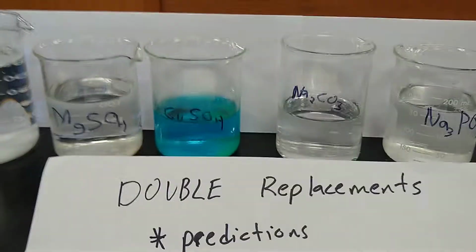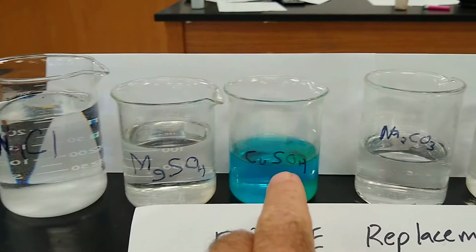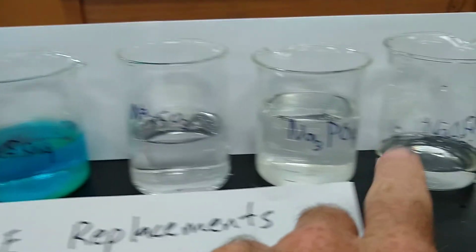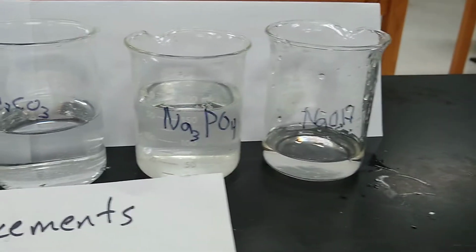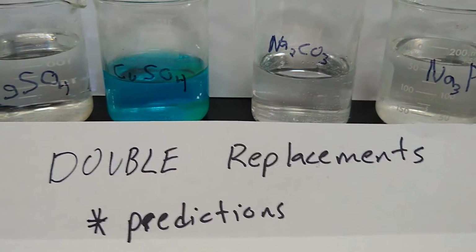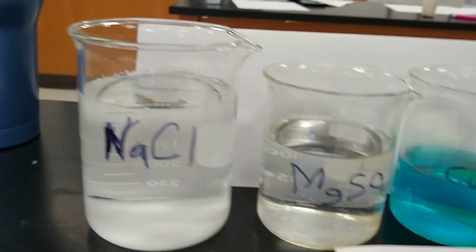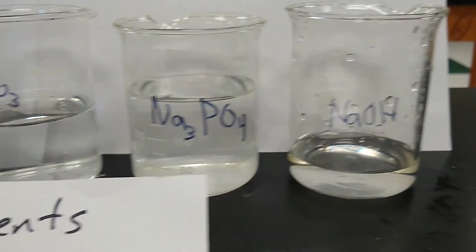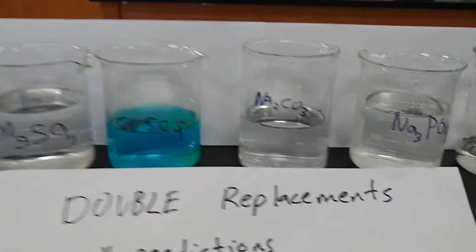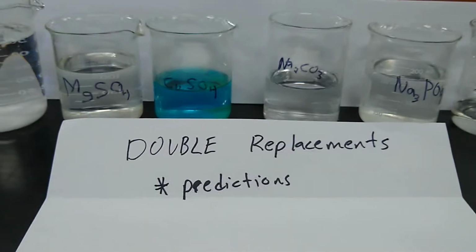What's up, people? Want to see something cool? Good. Here we have some aqueous compounds, and we are going to make some double replacement reaction predictions. We're going to do a little Ed puzzle here, and you can see I have some compounds ready to actually show you this happening. So let's get to work.